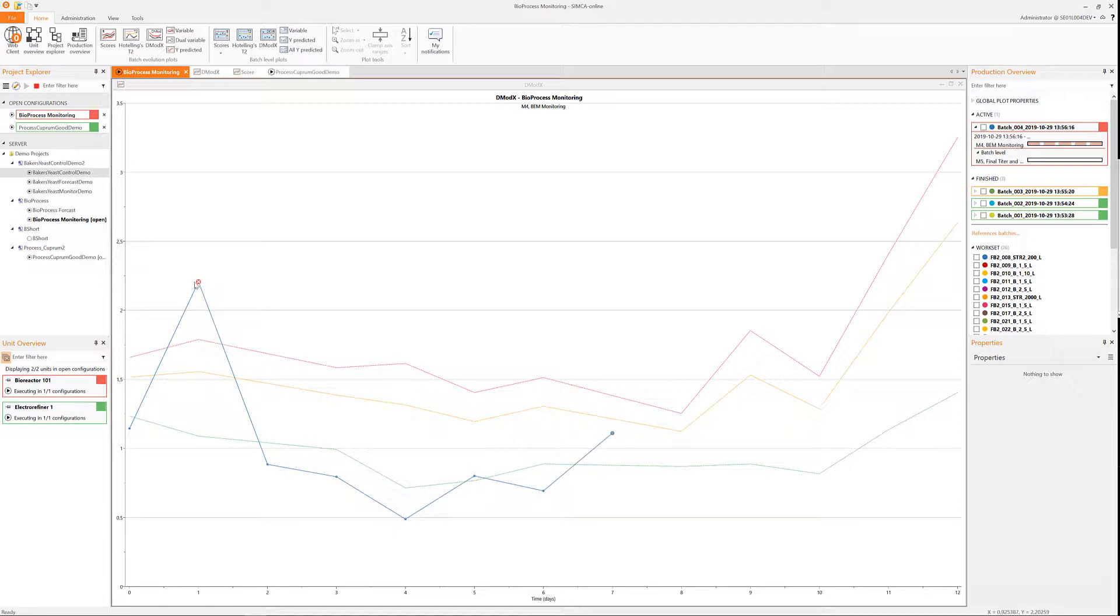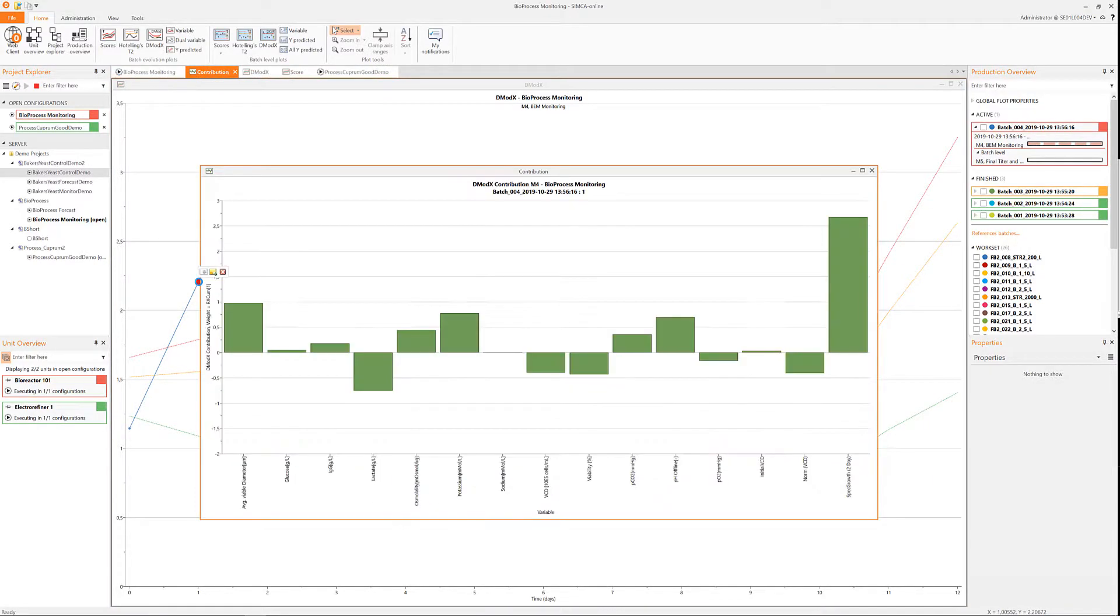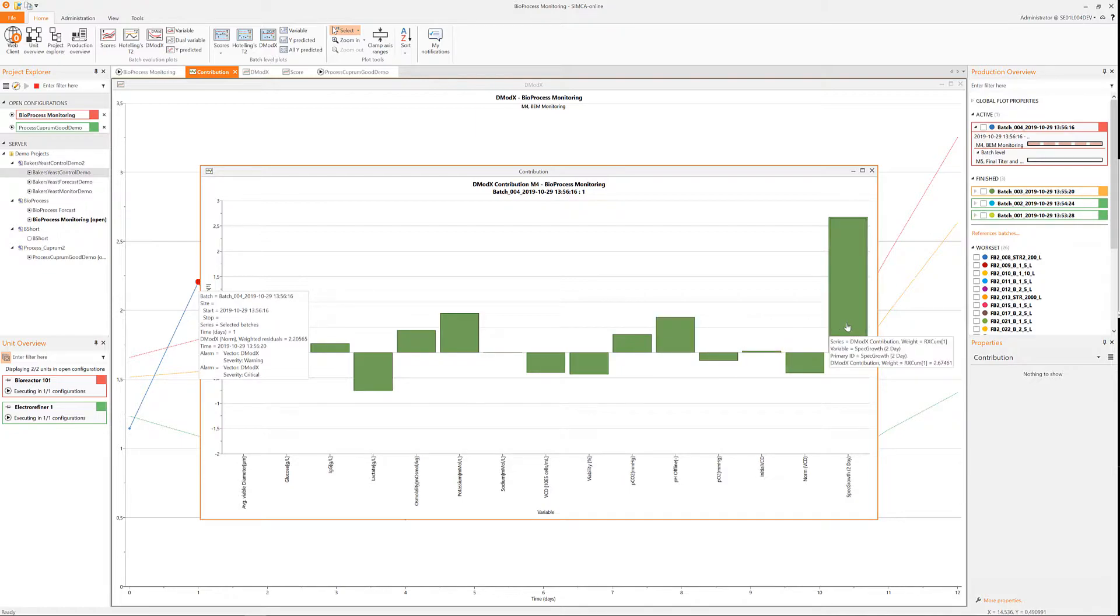When something has happened in a unit, a click on that unit will then open the relevant plots to see what has happened.